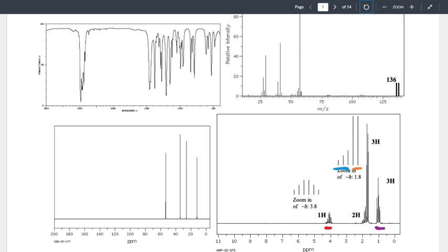For carbon, carbon-12, the most common isotope, is not magnetically active. So when we're looking at carbon NMR, what we're looking at is carbon-13, not carbon-12. And because it's less abundant, we can't guarantee that when we see a carbon-13, we're seeing the same carbon-13 in any individual molecule. So it's really hard to nail down a ratio of where they're all coming from.